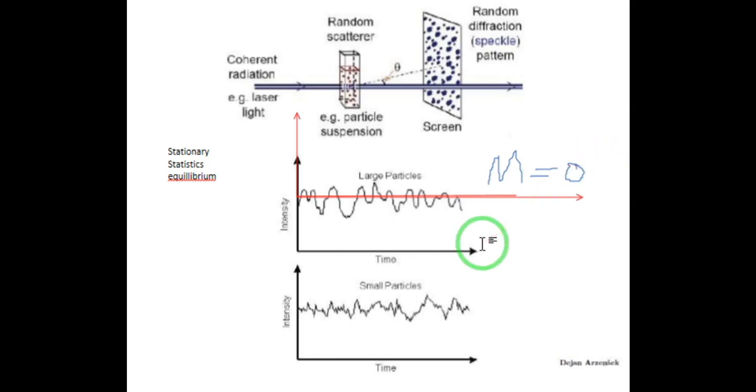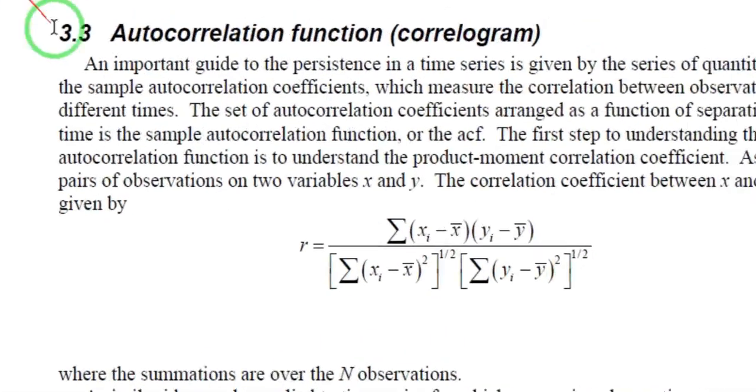Well, we want to use the concept and idea of correlation only for this pattern. Within the previous video, I showed you that we had 2 different signals, and in order to see how similar these 2 signals are, we introduced the normalized correlation for 2 different signals.